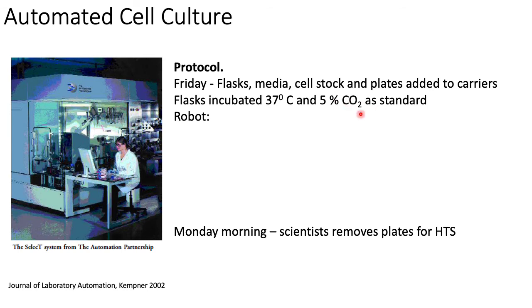As a standard, the robot would then remove the flask from the incubator. The incubator would be in the back here. You can probably just about see the arm here. The arm reaches into the incubator and then removes the flask from the incubator.